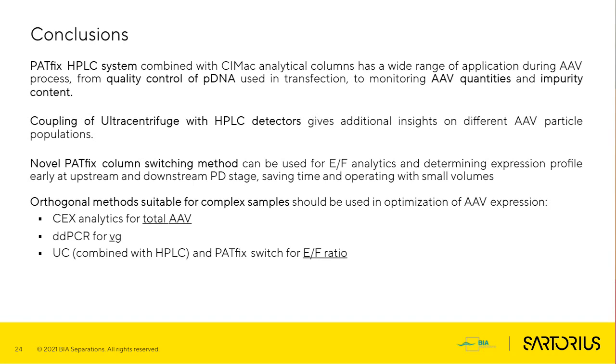So from Amber 15, for example, you can take a certain amount of your sample and gain some additional knowledge, which otherwise you would only get once you produce a bigger volume for your downstream team to purify. So this can be very, very useful.